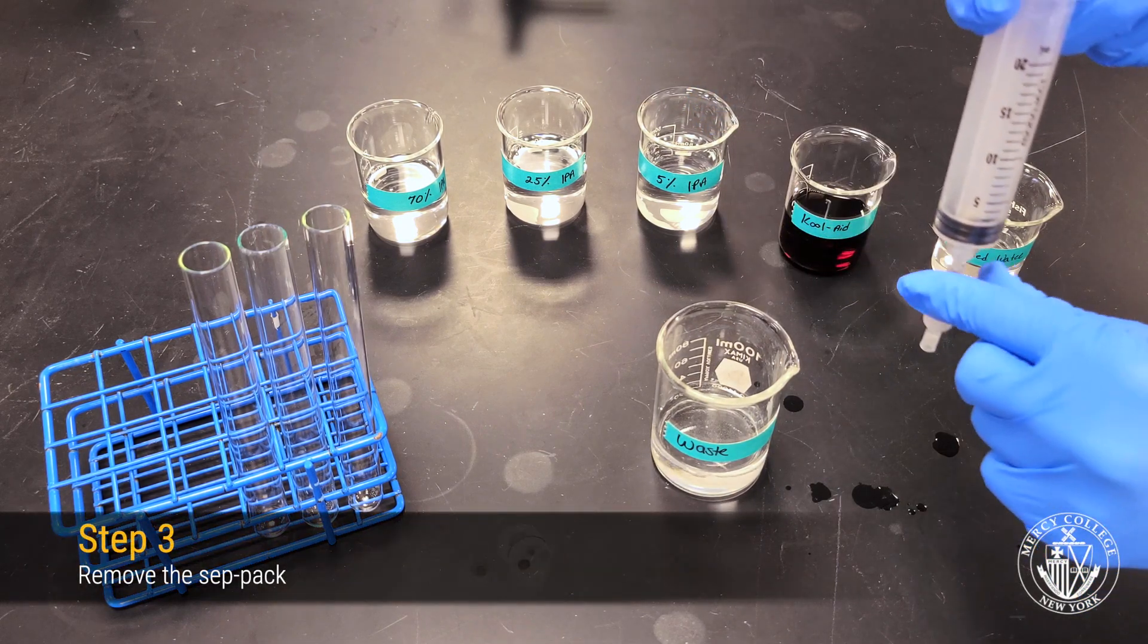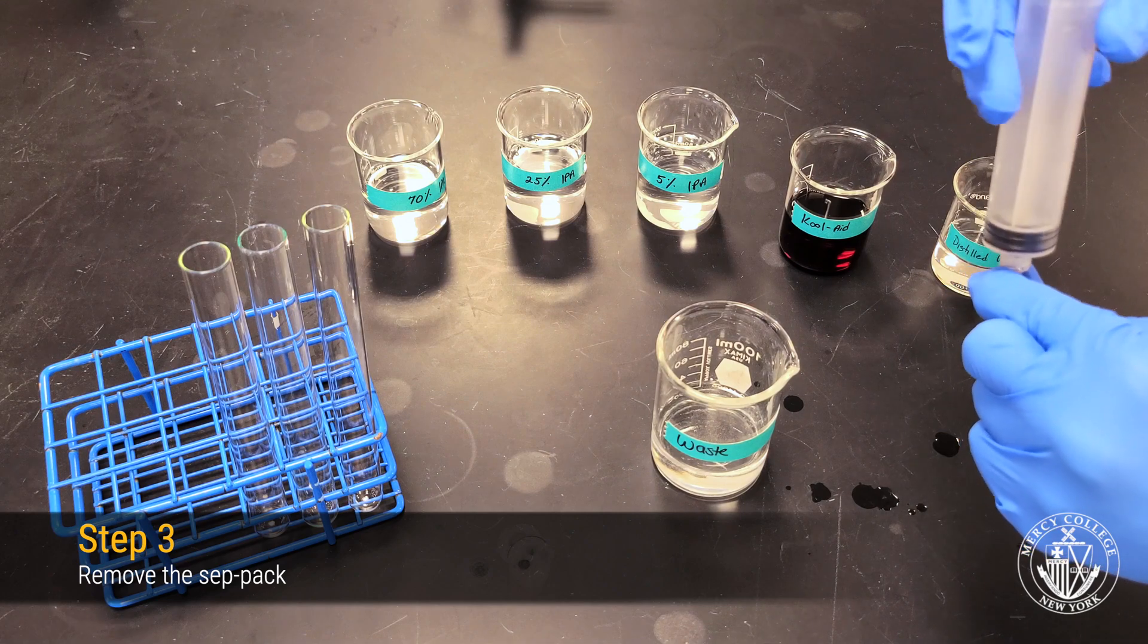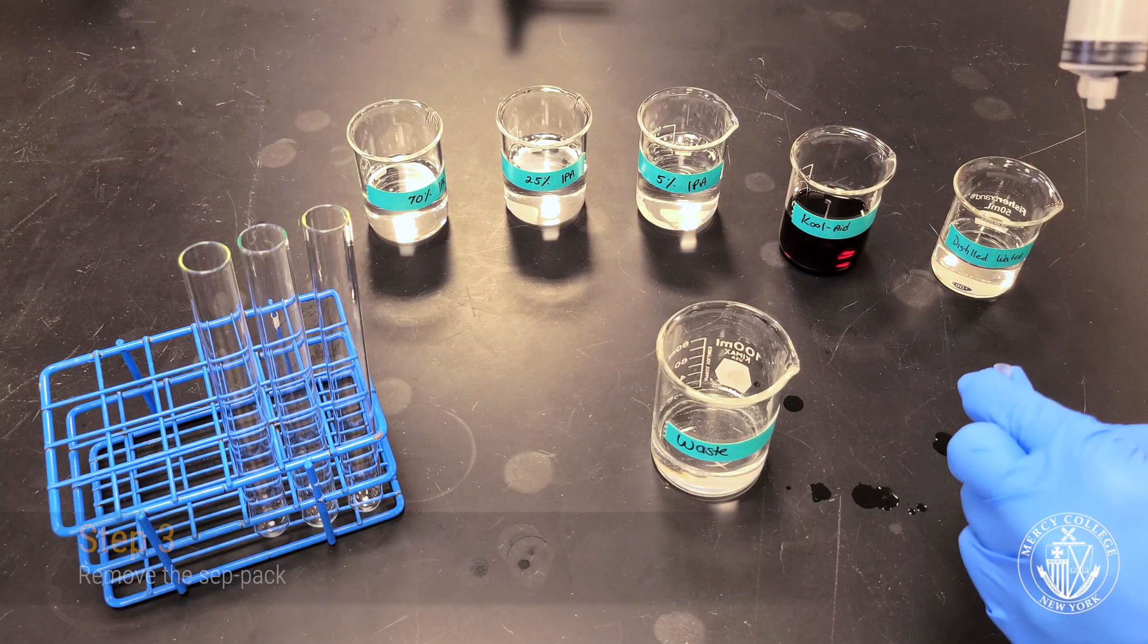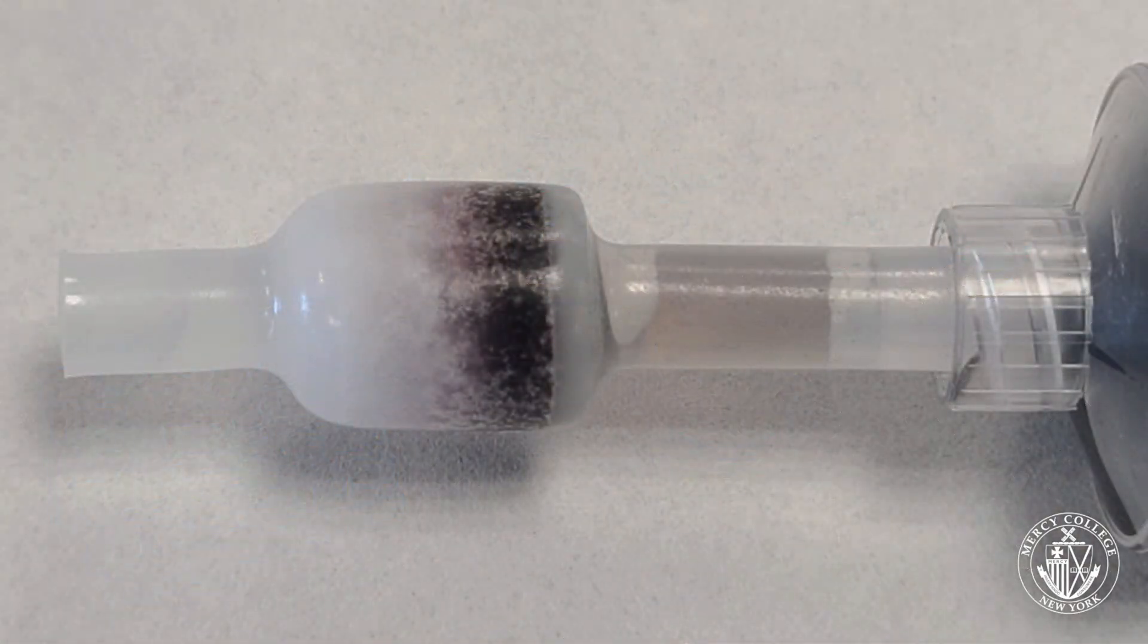Once you're done loading the column with the Kool-Aid mixture, remove the CEPPAC cartridge. A successfully loaded CEPPAC column will look something like this.